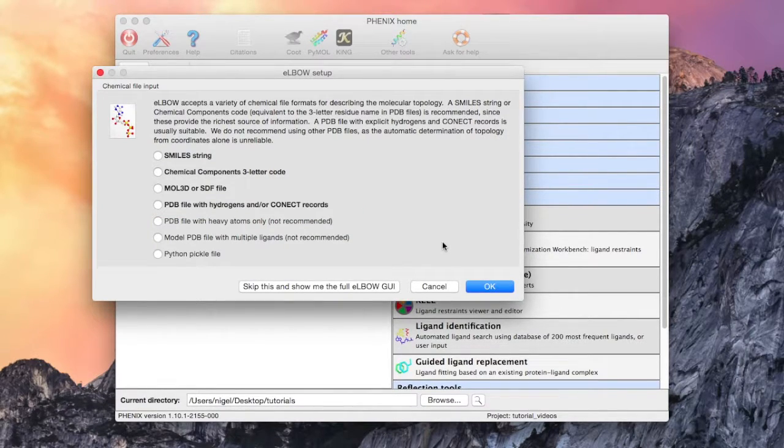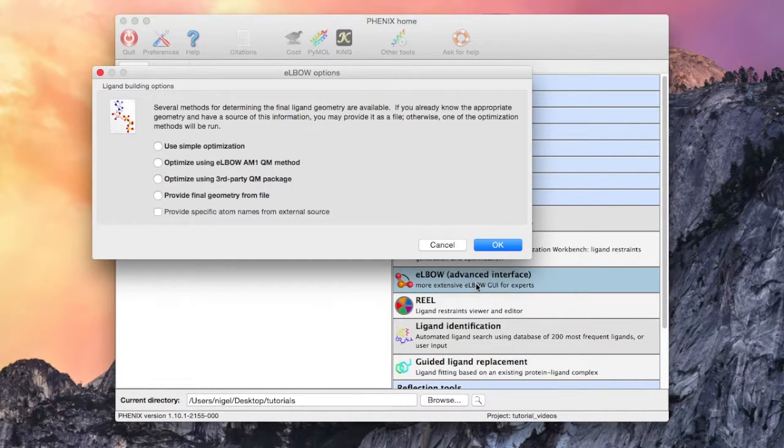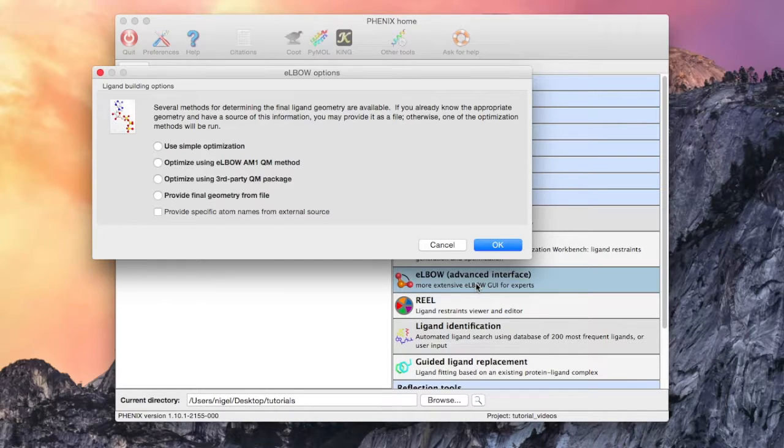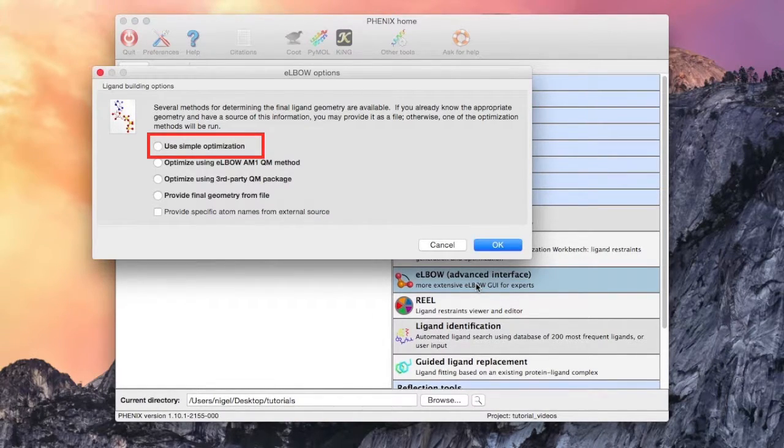Let's choose the chemical components input for this introduction. The next screen displays the options regarding the Cartesian geometry of the molecule. The simple option uses bond lengths calculated using quantum chemistry for ideal distances.